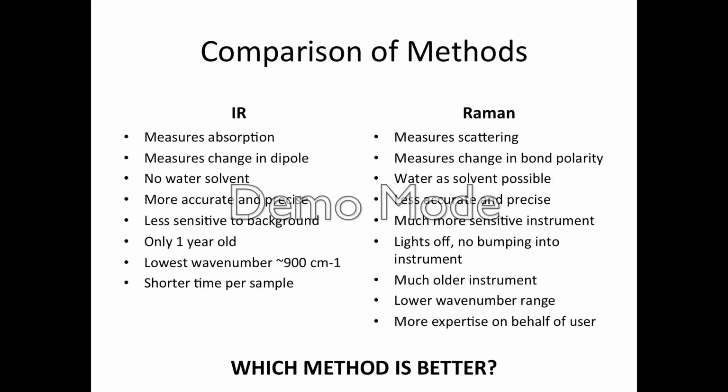The computer system was really fancy, whereas the Raman instrument is way older than that. I think someone said it was about 20 years old, and the technology in the computer was not nearly as advanced as that in the IR.